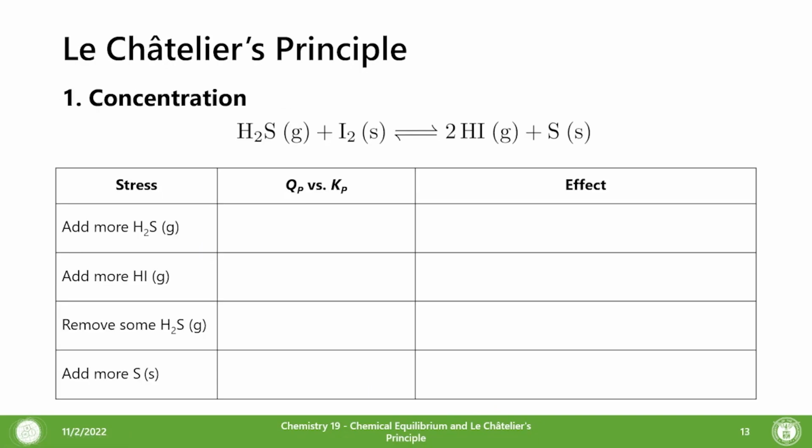Okay? So, what can affect our equilibrium such that Le Chatelier's principle can be applied? It's just a shortcut actually for doing all this math and trying to predict which reaction will proceed forward or backward. So if we add more H2S to this equilibrium, this is hydrogen sulfide, which combines with iodine to form hydrogen iodide or hydroiodic acid. Actually, it's hydrogen iodide and sulfur solid.